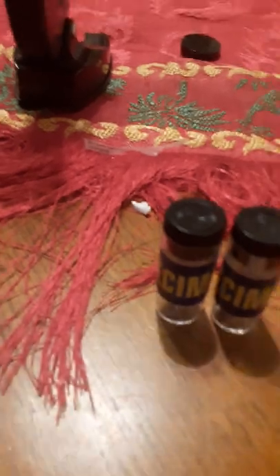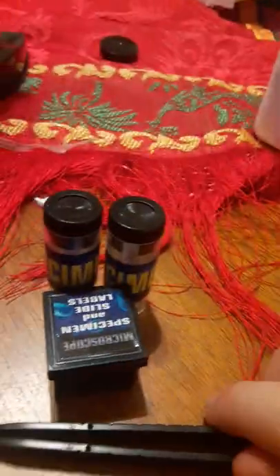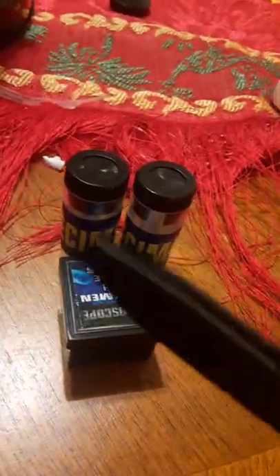So basically, let me tell you the other stuff. You have specimen jars, two specimen jars. Okay, I just wanna check. And then you have the box that has labels, and then you have tweezers that barely work, and that's why I use actual tweezers. You can capture almost any of your specimens in there. Just be careful, you don't want to get any viruses in there, just kidding. All right, see ya, bye bye.